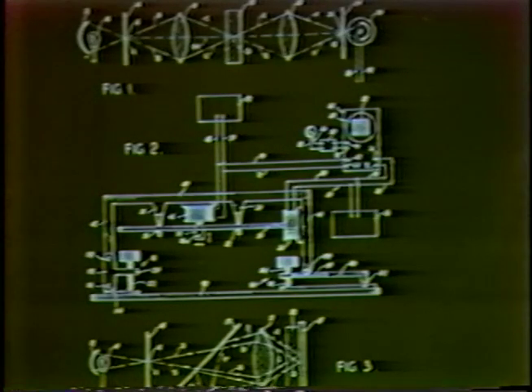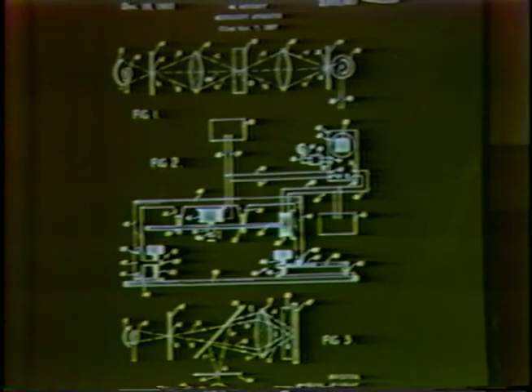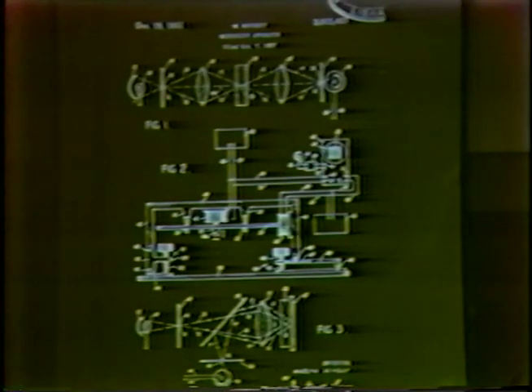Now, confocal microscopy goes back in the literature, as far as we know at the moment, to this reference by Marvin Minsky, now of artificial intelligence fame, who filed this patent in 1957. So we're looking at him having already invented it more than 31 years ago, and it's taken really up until the present for it to become exciting for the interests of manufacturers. And I think there are probably now a dozen or 15 different confocal microscope manufacturers on the market, and some of them will be represented here at the equipment exhibition.